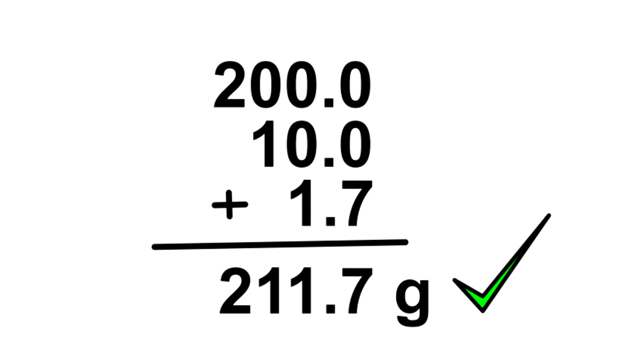So I have to add up these numbers: 200 plus 10 plus 1.7 gives me a correct reading that the mass of this apple is 211.7 grams.